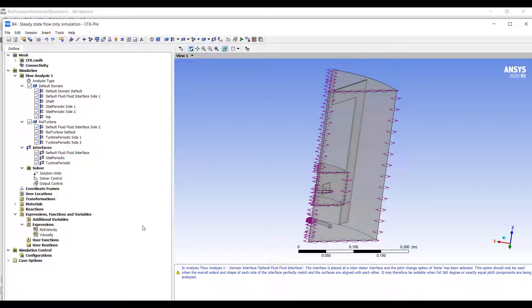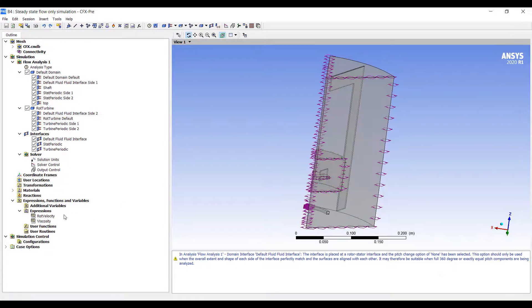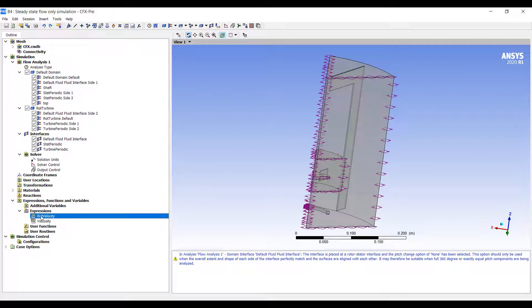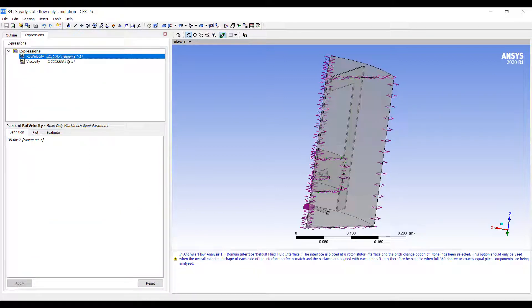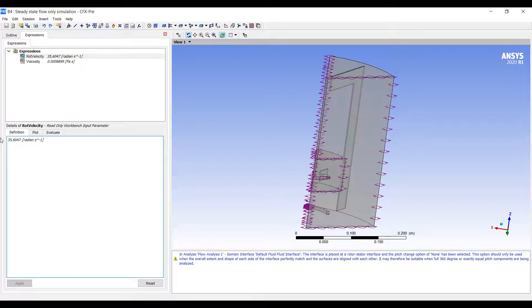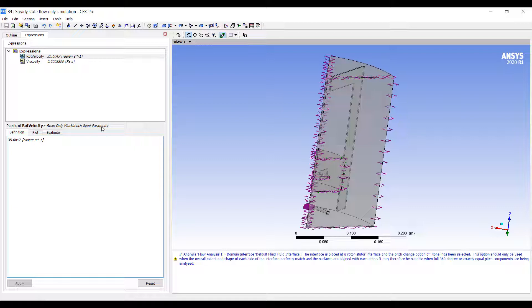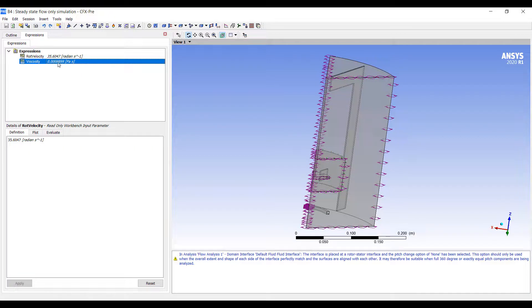The way we specify parameters is we create expressions. These are simple constants. You can put in any units you want. I'm starting at 35 radians per second here, which corresponds to about 340 revolutions per minute. And we have a viscosity value here.